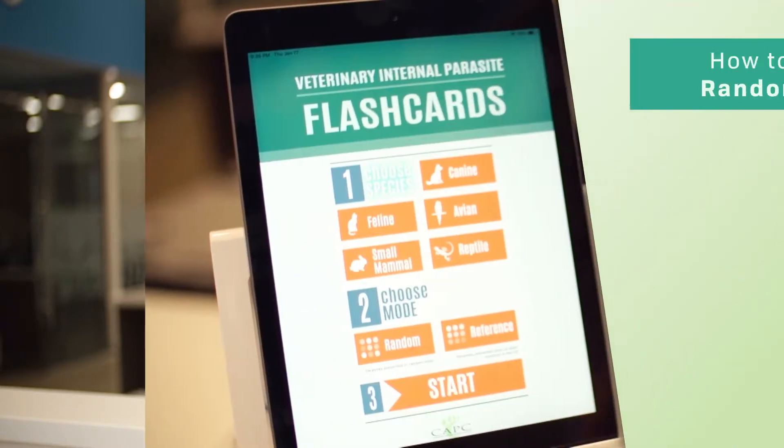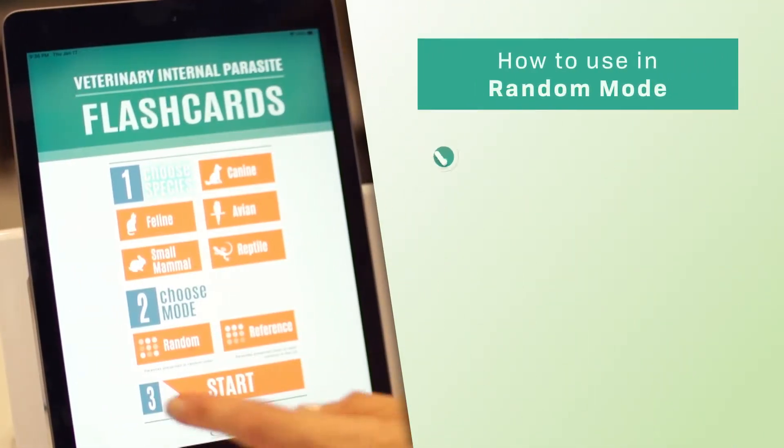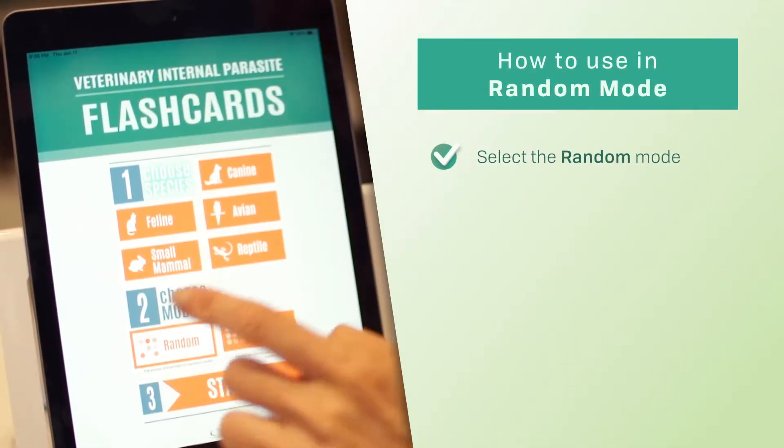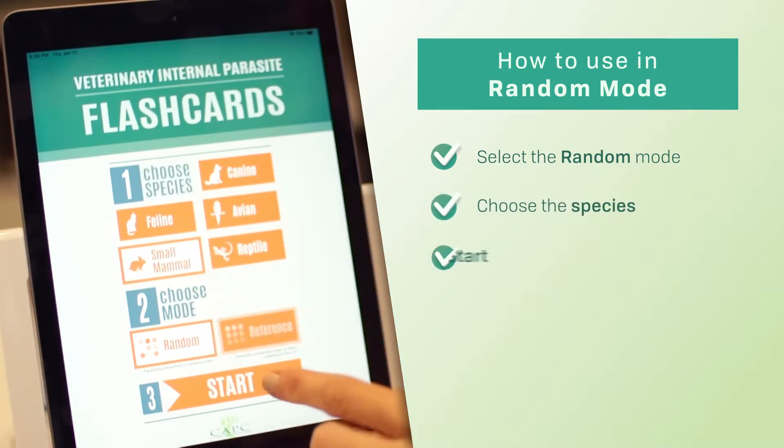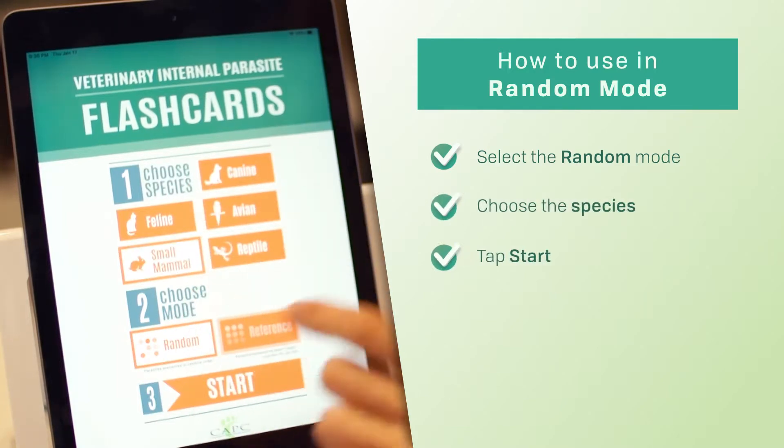This is a great app to use as a group, and you can even make a game out of it to see who's at the top of their game for parasite identification. So let's go to the app's Random Mode — select Species and press Start.